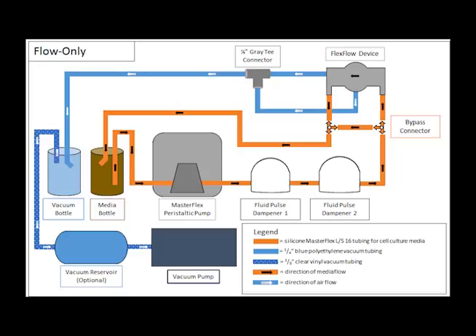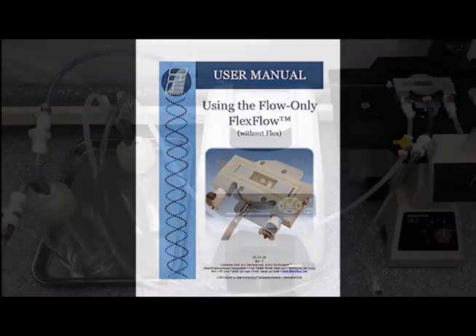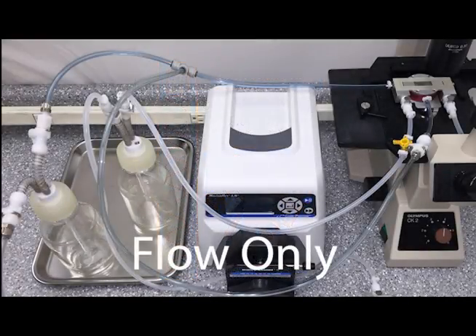Before the first use, run deionized water through the entire system to make sure there are no leaks. Prior to use with cells, please flush the entire system first with PBS and second with the desired flow perfusate. Please see the FlexFlow user manual for proper techniques on handling the slides and ensuring the system is air bubble free. Your FlexFlow system is now ready for use in flow only mode.